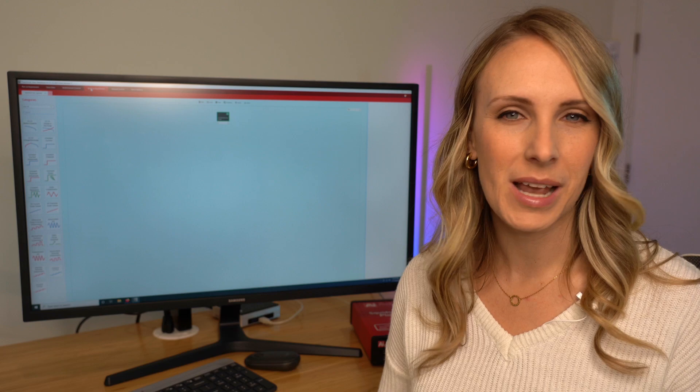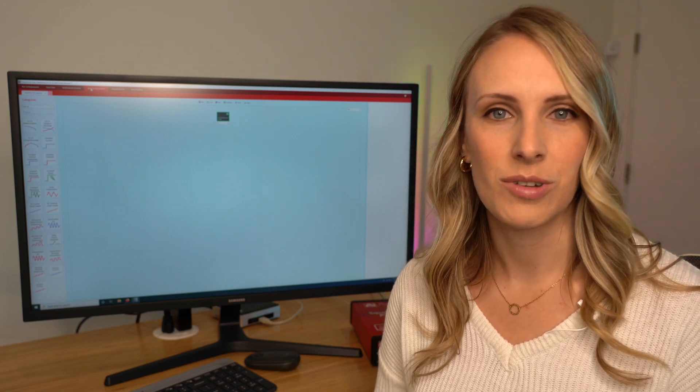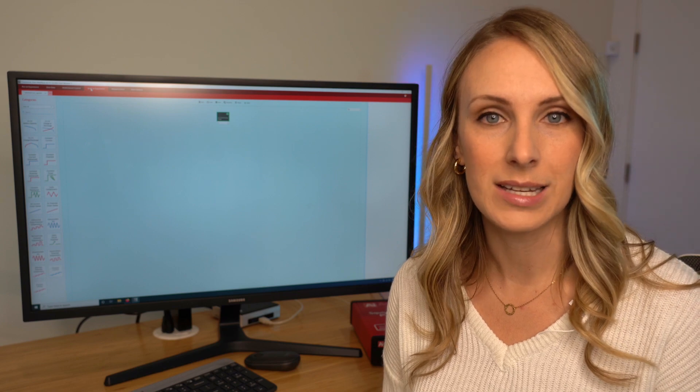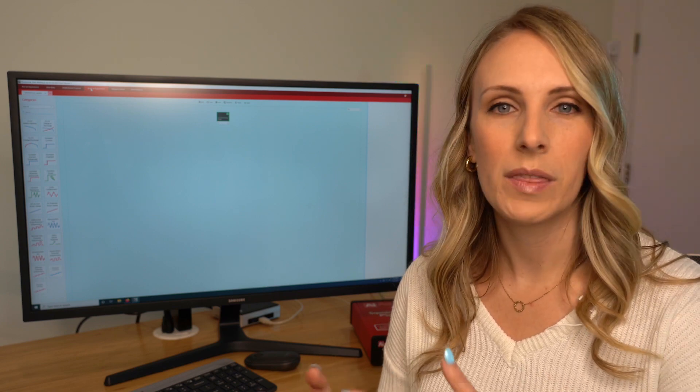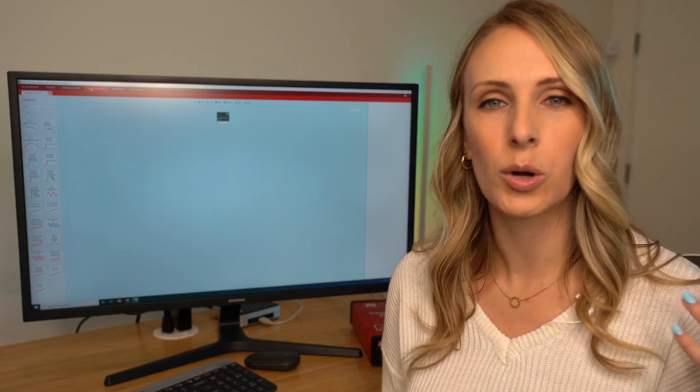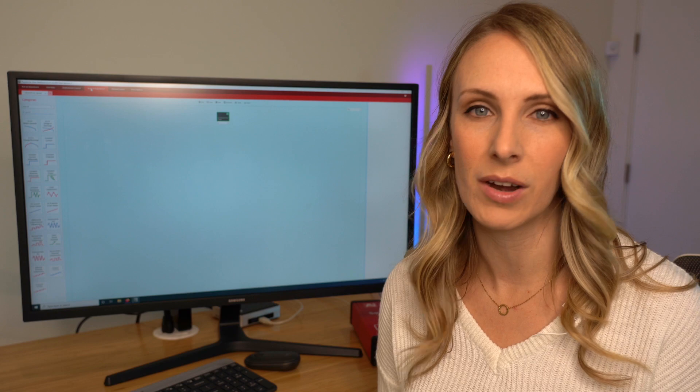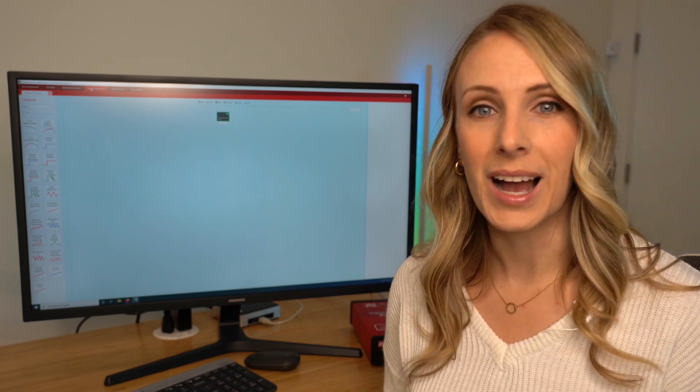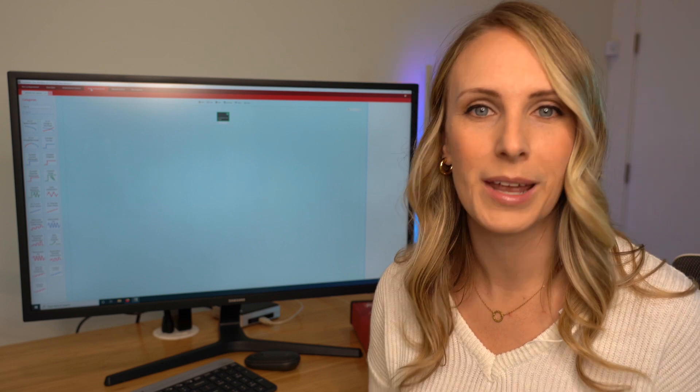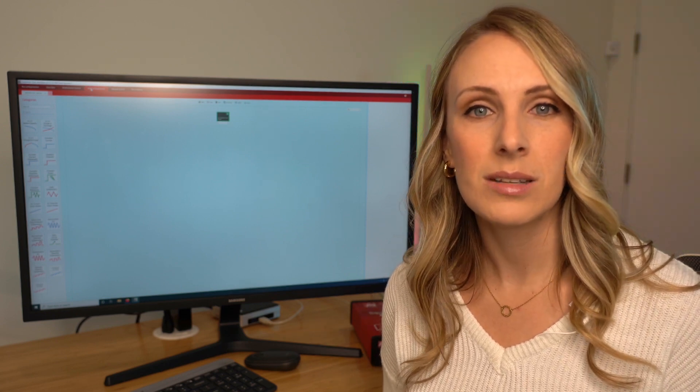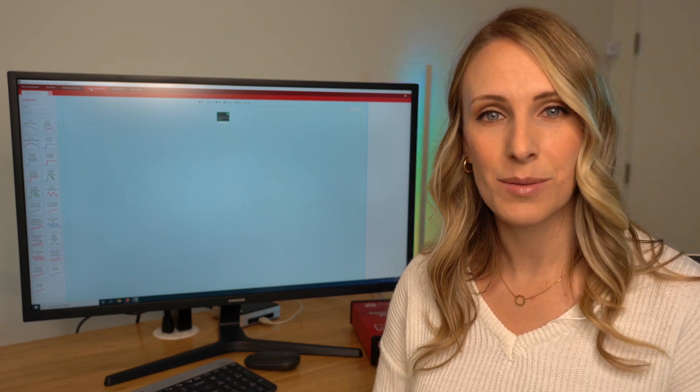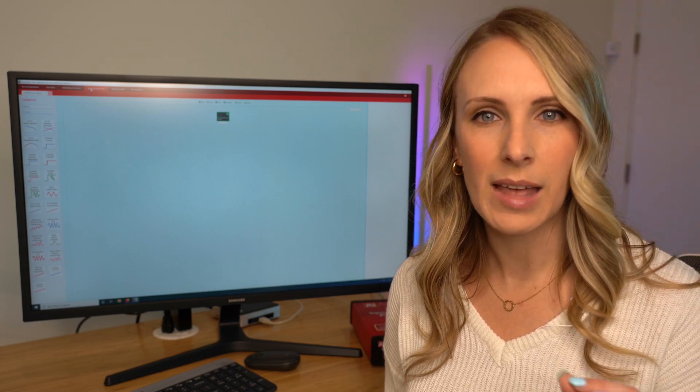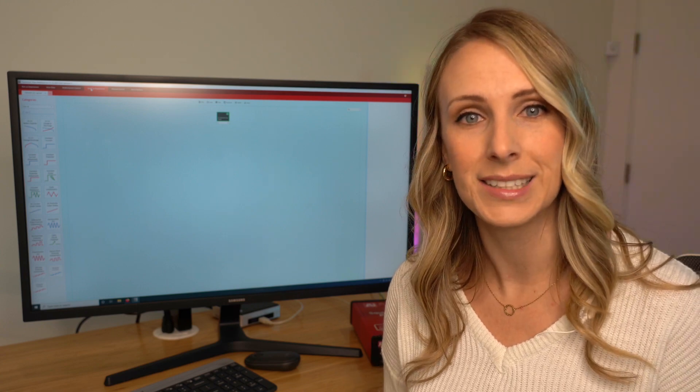It's like taking a picture of something when the subject is moving. It's going to become blurry. That current readout is not going to be very high resolution. The advantage though to using a high scan rate is not only that you complete your experiment quicker, but also because certain systems actually change over time. And so by scanning a system quickly, you're capturing that brief moment when that system was in whatever state it was in.